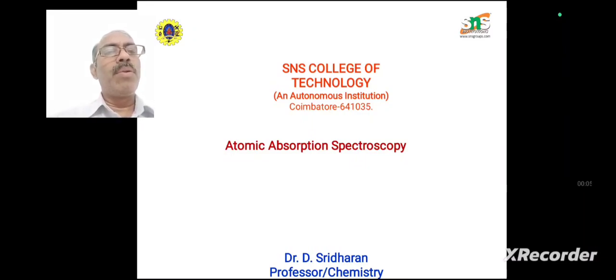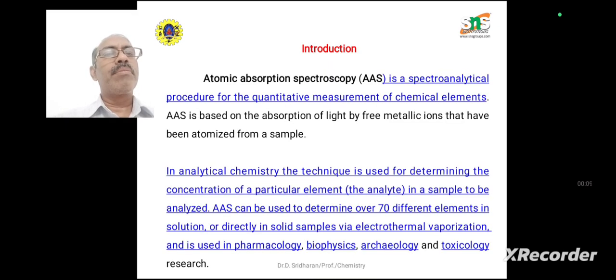In this session, we are going to discuss atomic absorption spectroscopy. Introduction: AAS is a spectro-analytical procedure for the quantitative and qualitative analysis of chemical elements and chemical substances.